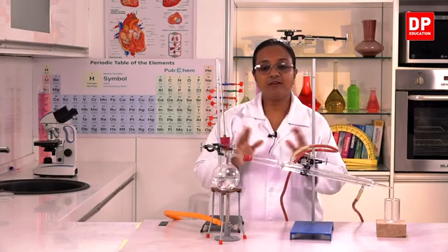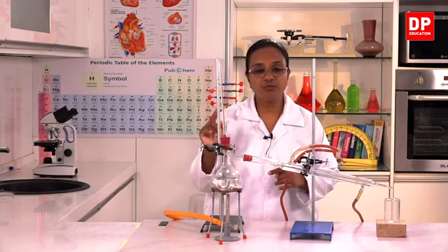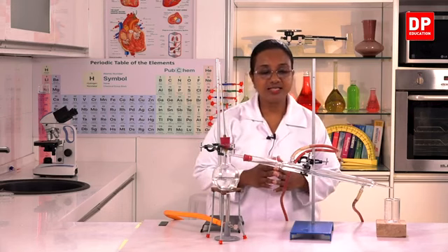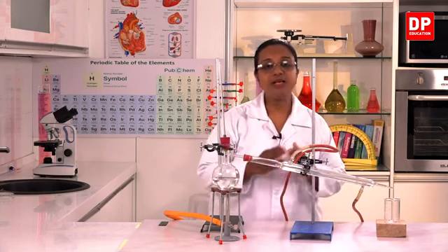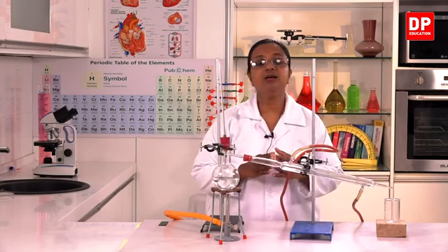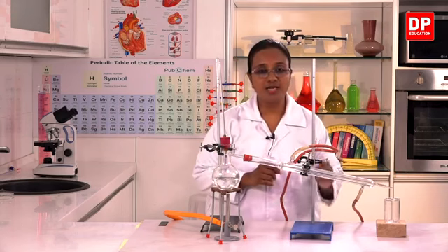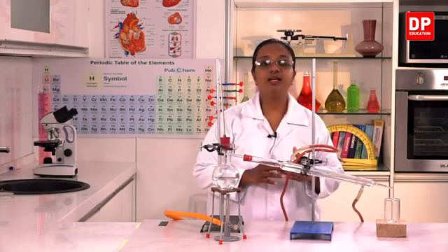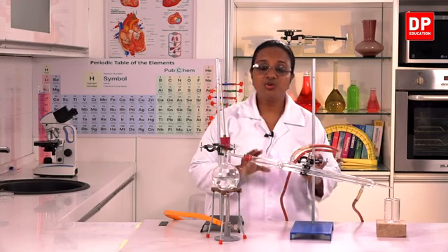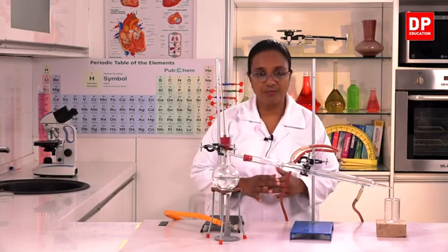So here we have the full setup. You know why we use the thermometer to monitor the temperature, and why we use the round bottom flask, that is the distillation flask, and Liebig's condenser to condense the vapor and to collect the pure liquid. And also you have to remember how water is sent into the condenser as well as how it is taken out from the condenser, so that we make sure there is enough uniform cooling.